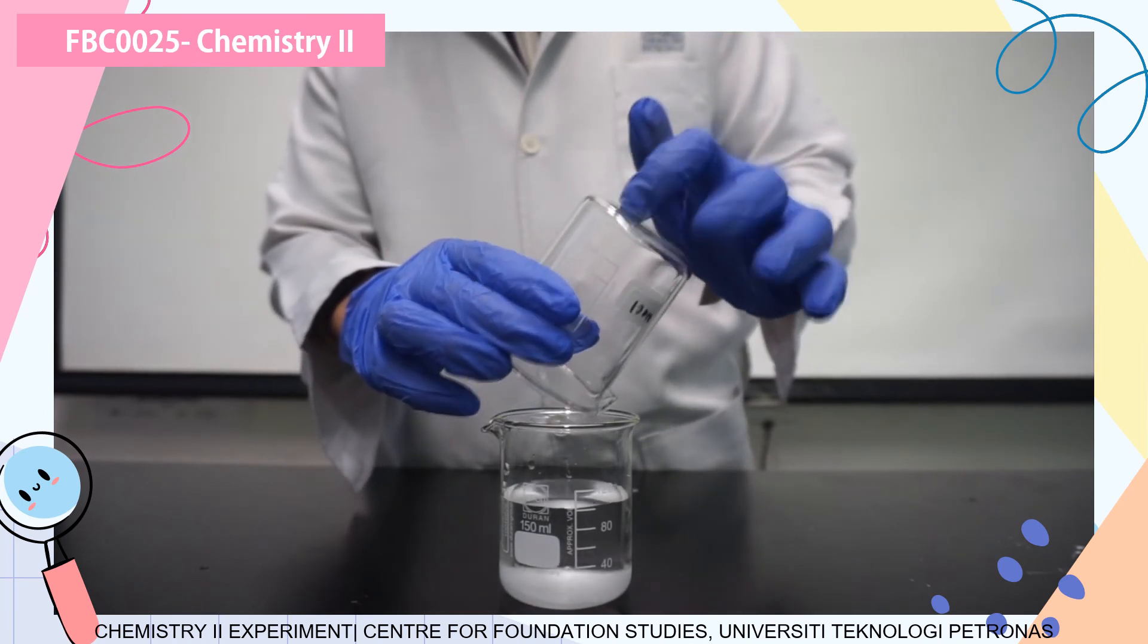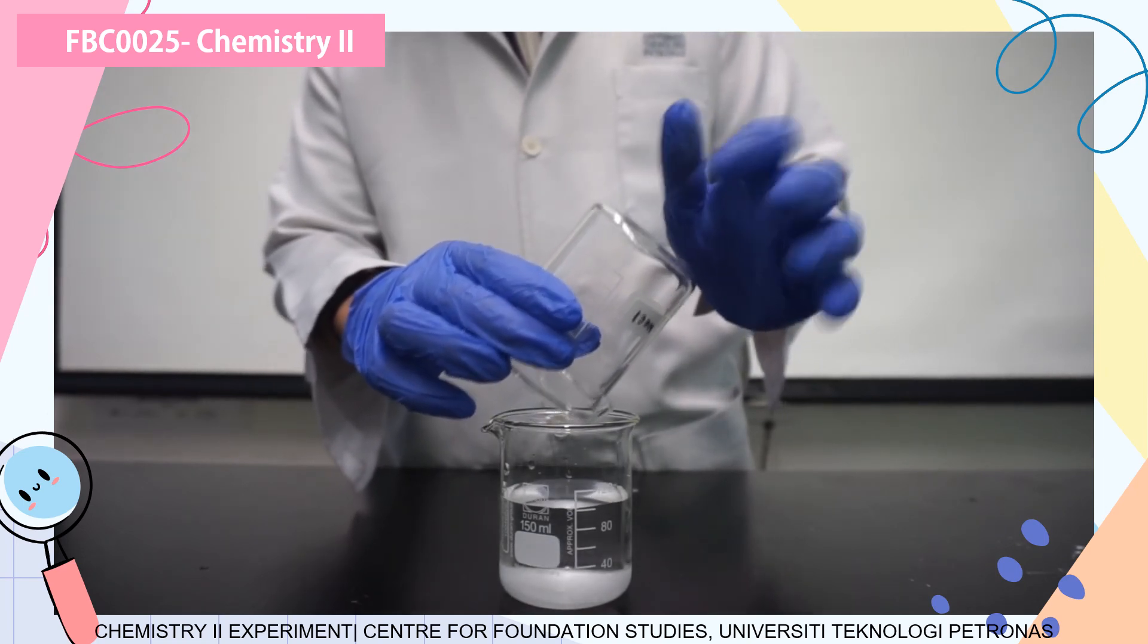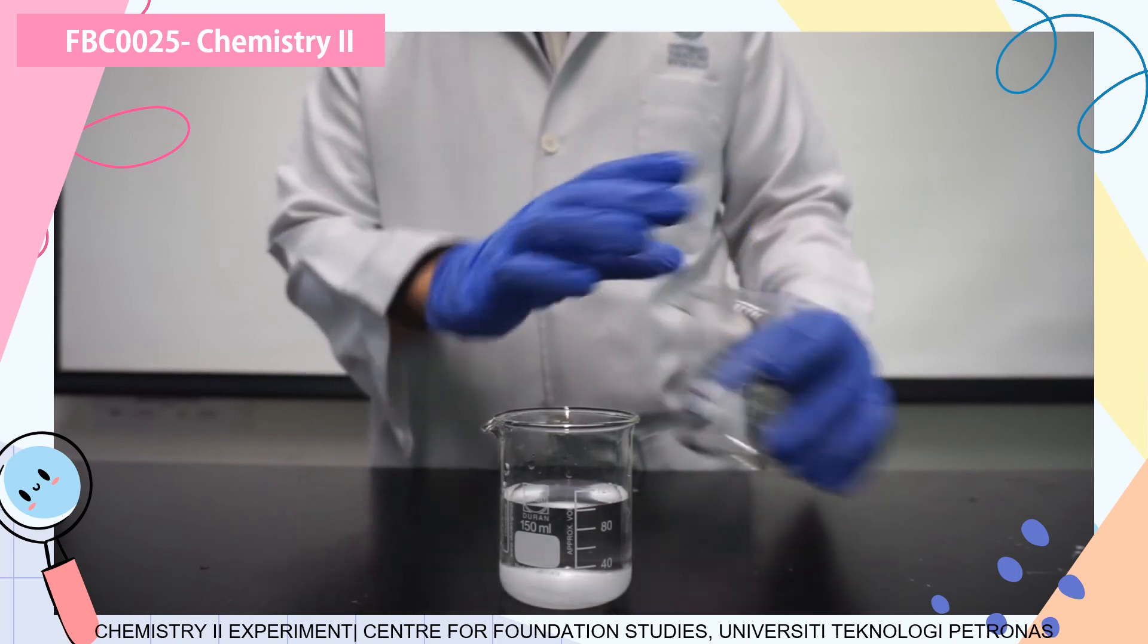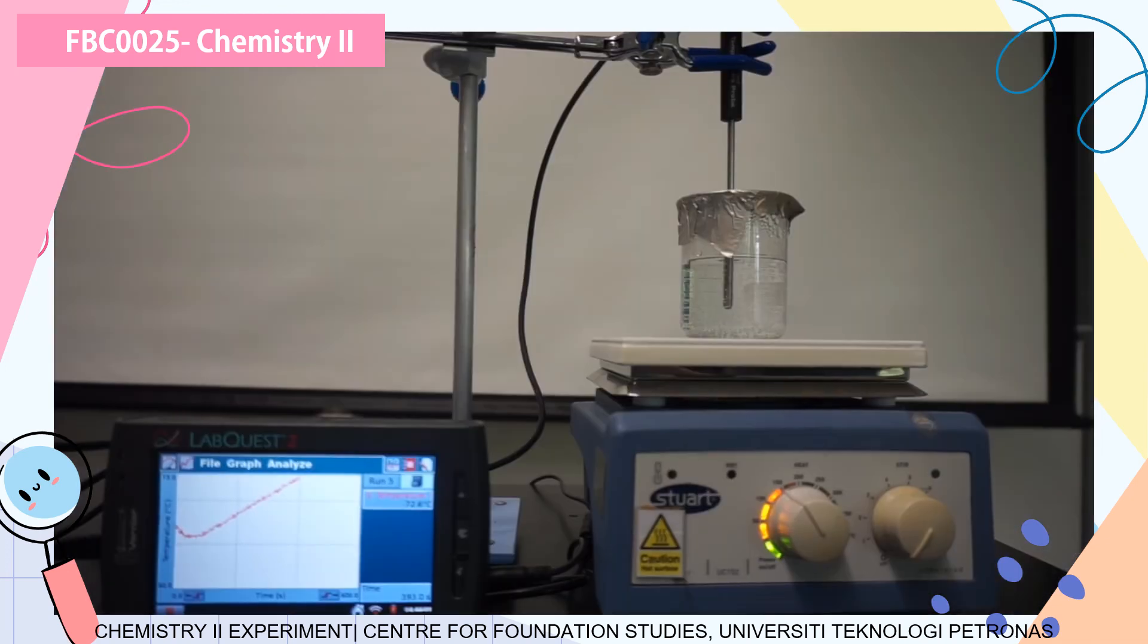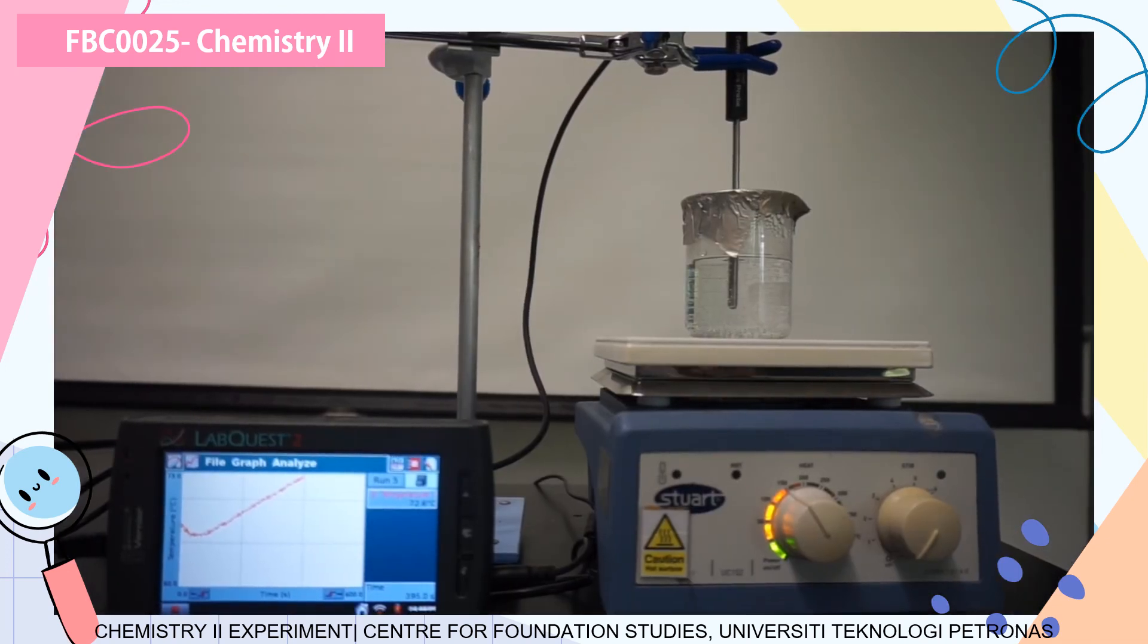After that, we are just going to repeat the same thing. Make sure it's dissolved, and then we are going to start collecting the data to determine what is the boiling temperature of the water or the solution under the presence of sodium chloride. I hope that it is clear for you and you understand how to do it.